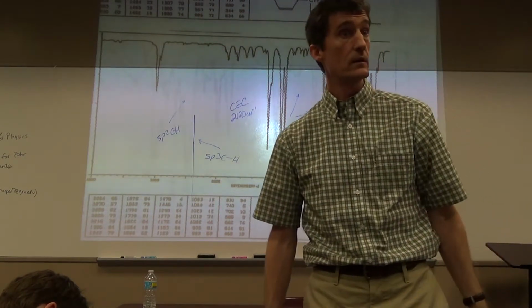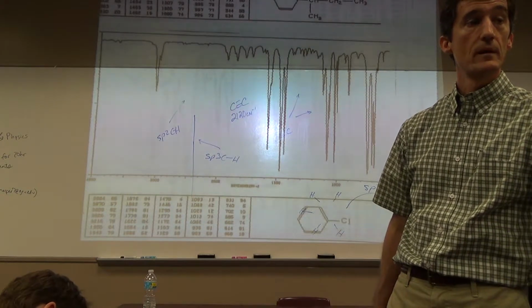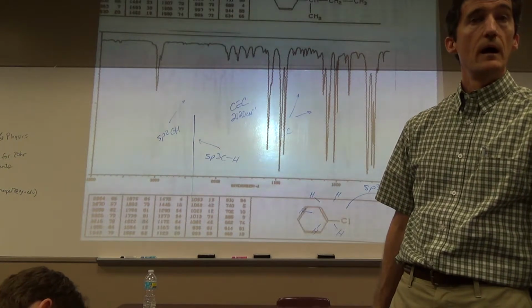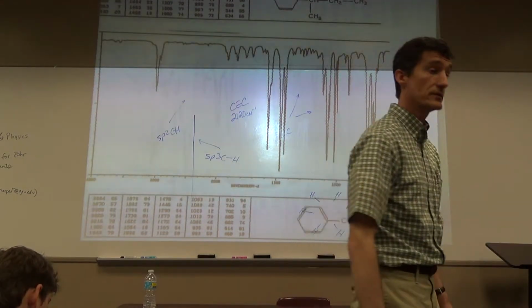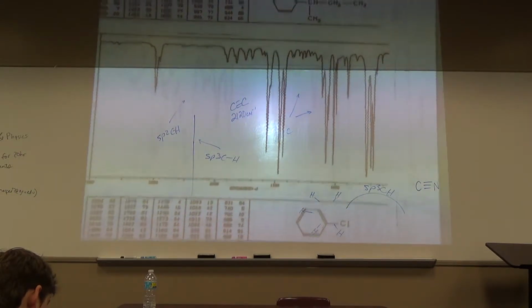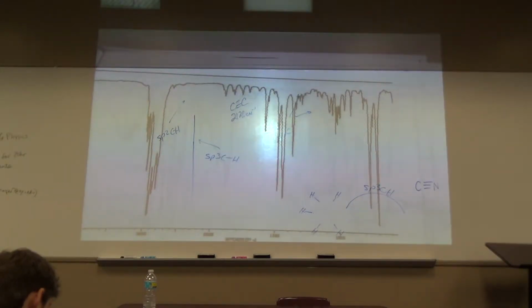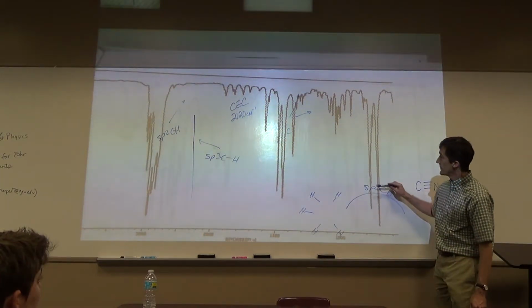Question? On the one we just finished, around 1400, would that be considered an overtone? Because on the chart we were looking at a second ago, is it an overtone of a peak at 700? Yeah, is there a strong peak at 700? It looks like it, it's 699. Right at 1400 and you're right at about 700.